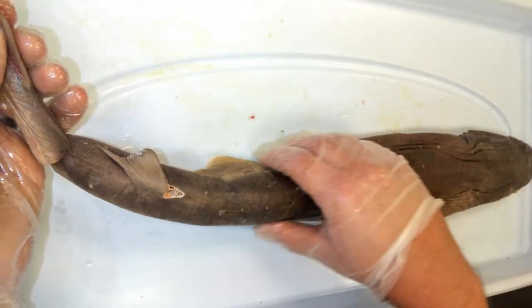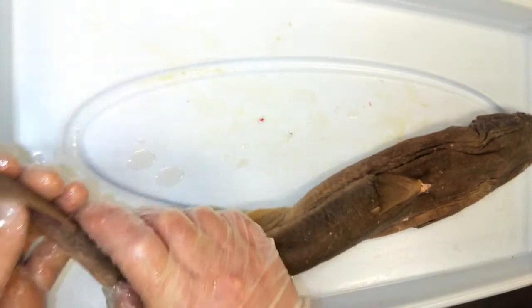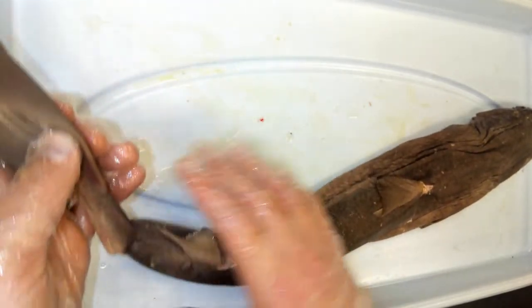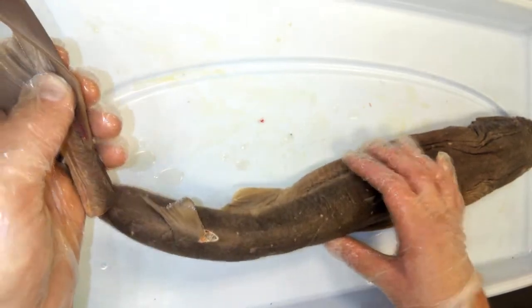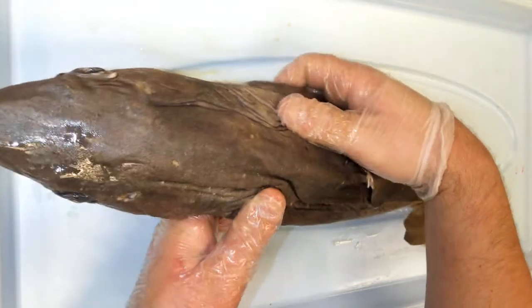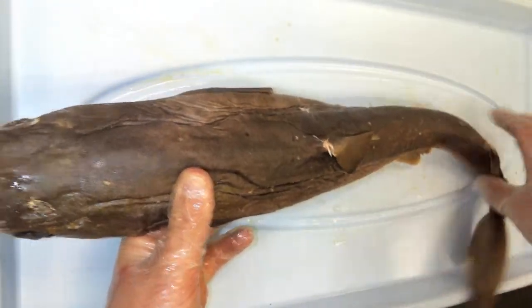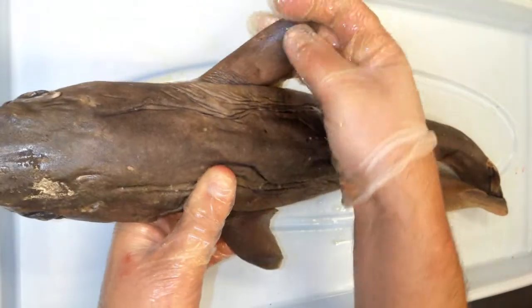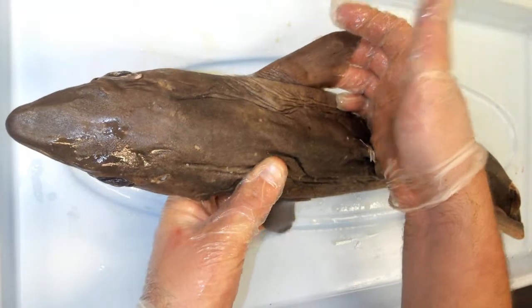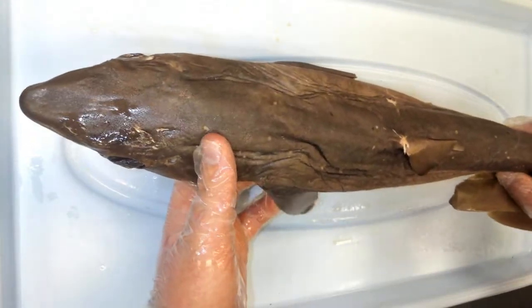Sharks have muscles throughout their body that contract and cause this caudal tail to move back and forth, giving them a lot of propulsion. As they are propelled forward by this thrusting tail, they have these pectoral fins that stick out to give them lift.